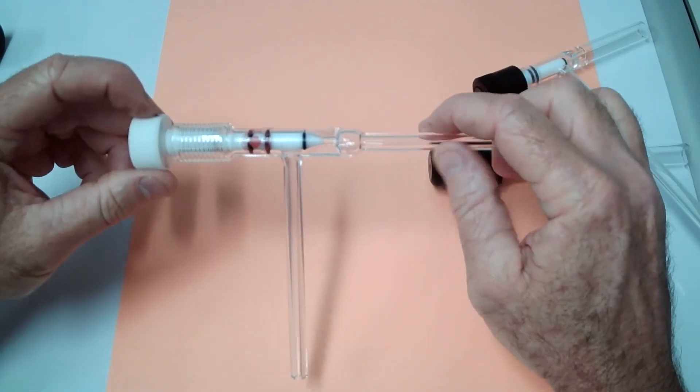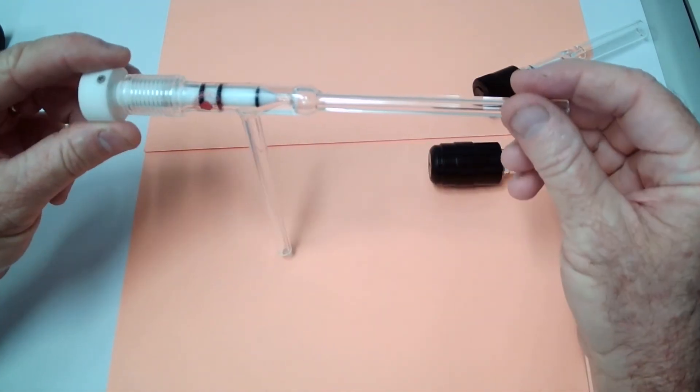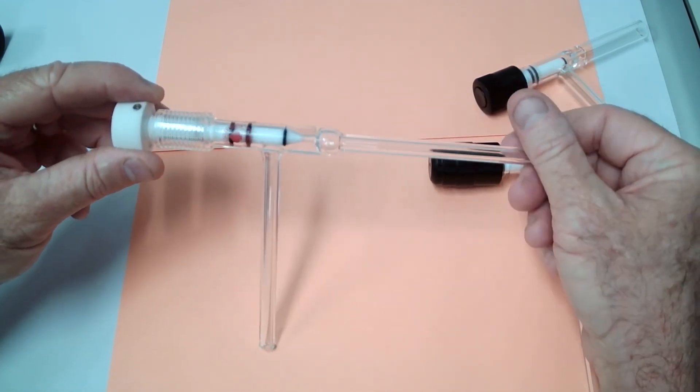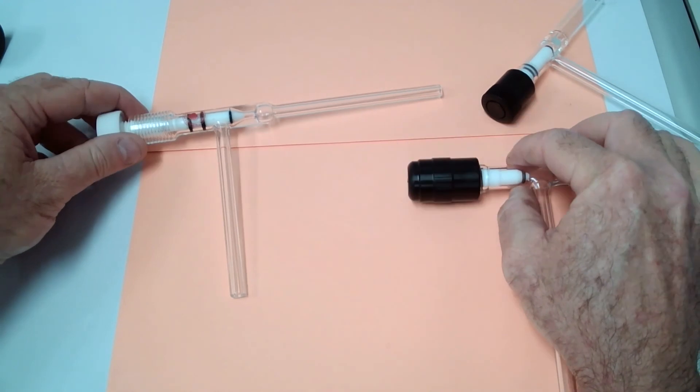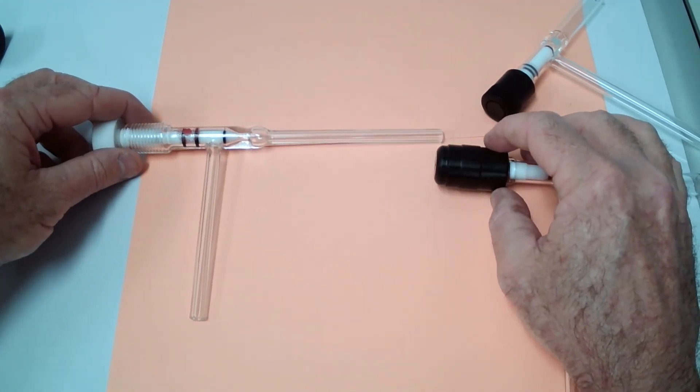They also make the plugs of different materials. This being all Teflon, which is a bakeable or autoclavable valve. These other ones have the plastic knobs which are not autoclavable.